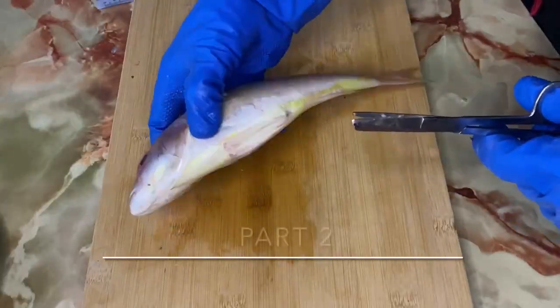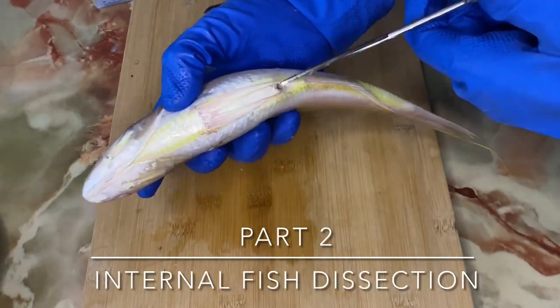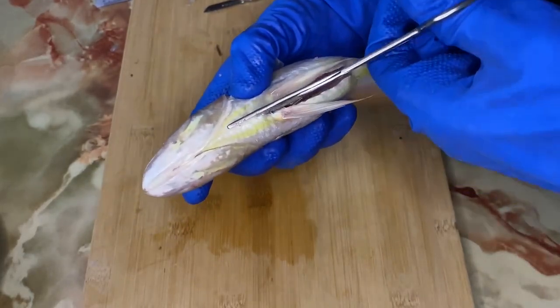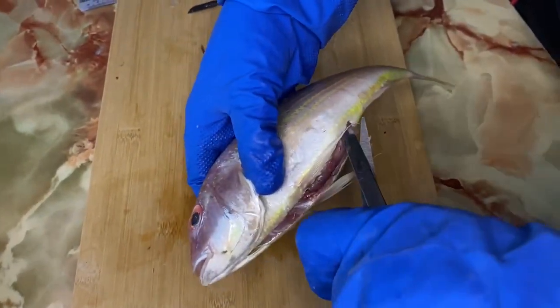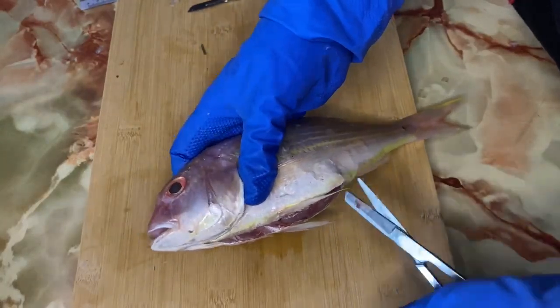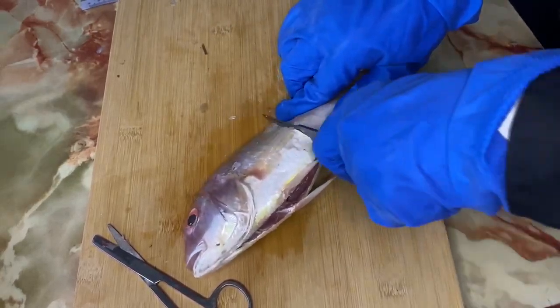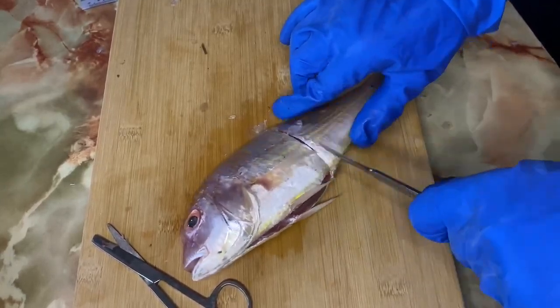Part 2: Internal fish dissection. I start by cutting from the anus all the way up to the upper operculum using scissors. After that, I make a lateral incision above the anus and also above the upper operculum using a scalpel.